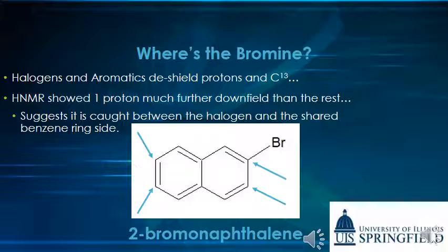Now I do want to point out that technically you could put the bromine on any of the 4 spots denoted by blue arrows and it would still be the same structure. So now we're going to see if this structure holds up against our environments.